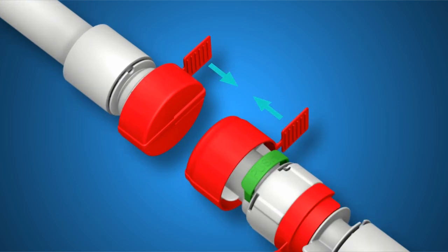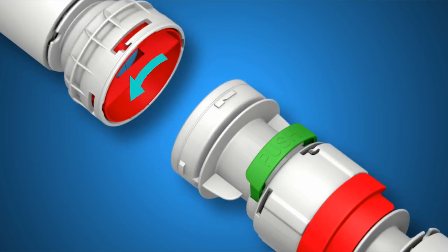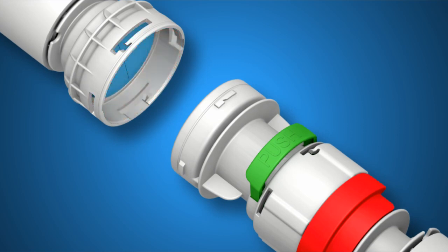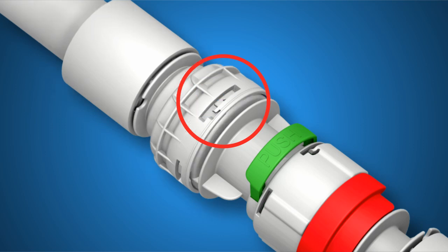Pull up the tear tabs, then remove the protective caps. Next, turn the valve cover counter-clockwise until it stops, then pull out to remove. Insert the inner housing into the outer housing, making note of the lock size versus the slot size. You can now rotate the inner housing inside the outer housing to line up the locks. Insert the inner housing locks into the locking track window, then rotate the inner housing counter-clockwise until it locks.